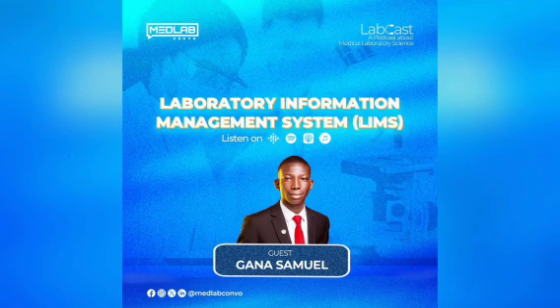Secondly, because we understand that human beings are prone to error, it is also good that laboratories that are starting small should be able to integrate their machines if they are running automation. They should be able to integrate their machines on the LIMS. But if they are running manual, of course, they would have to type it in manually. But if they are running automation, it saves sample error, entry error, whatever kind of error that we think about.